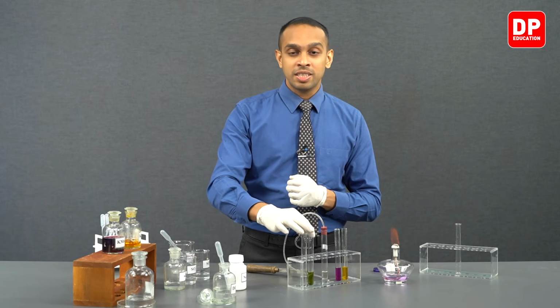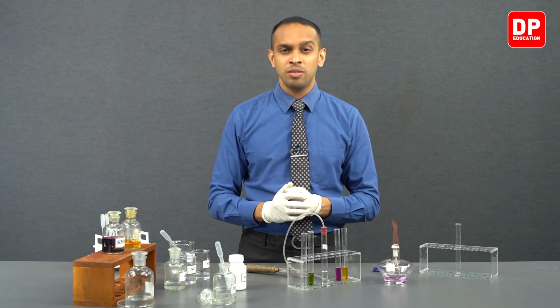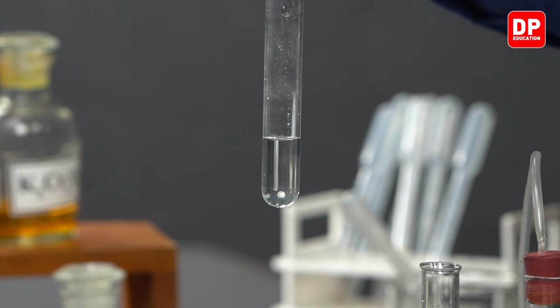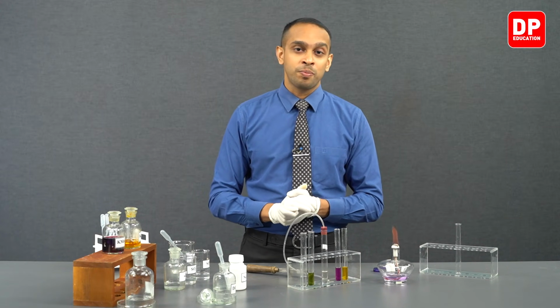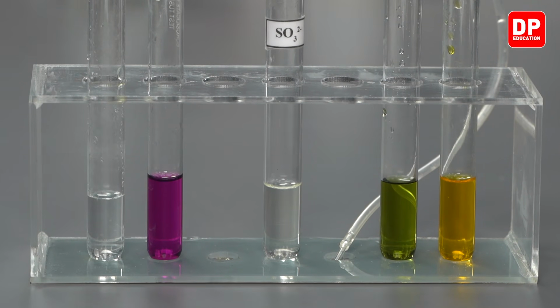And when we send sulfur dioxide through potassium permanganate solution, which is purple in color, we saw it changed color to a colorless solution. So this indicates the presence of sulfur dioxide. So you can identify the presence of sulfite ions through addition of HCl and send in the gas that is produced through an oxidizing agent such as acidified potassium dichromate or acidified potassium permanganate.